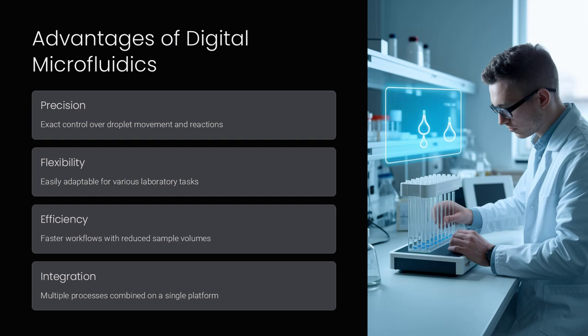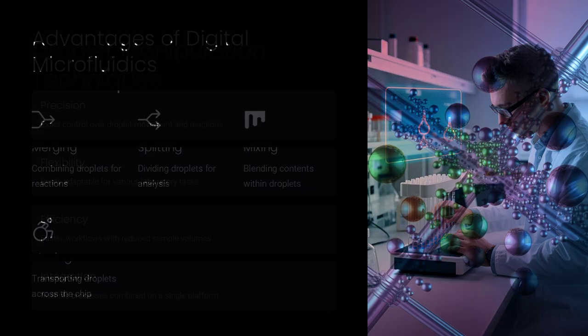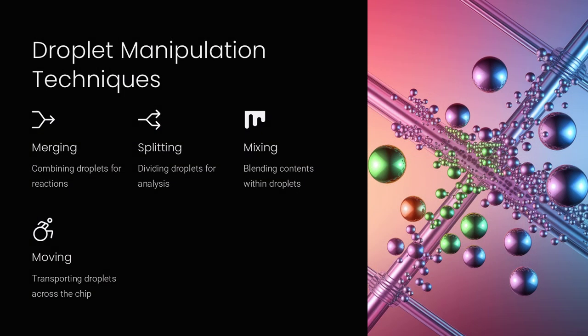A digital microfluidic device can be programmed to mix reagents, incubate reactions, and analyze samples all on one chip, reducing manual intervention. Imagine a smart, modular kitchen countertop where you can reconfigure different cooking stations at the touch of a button to prepare a complete meal automatically.